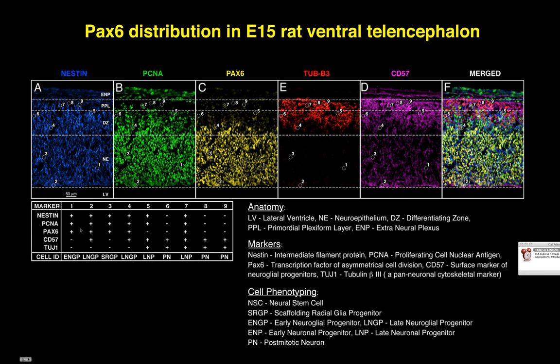So you can use a matrix, kind of a table, to identify a specific phenotype of interest, and based on that phenotype, do some quantitative analysis.